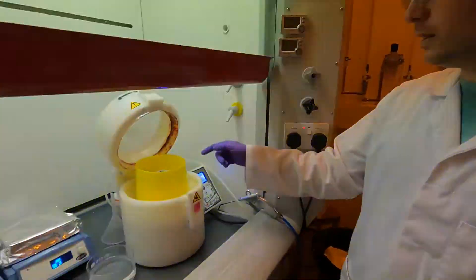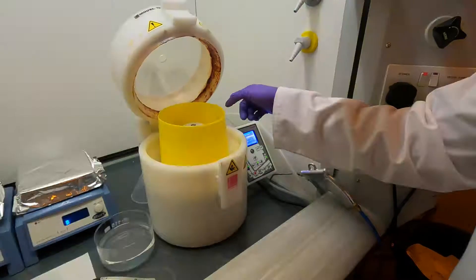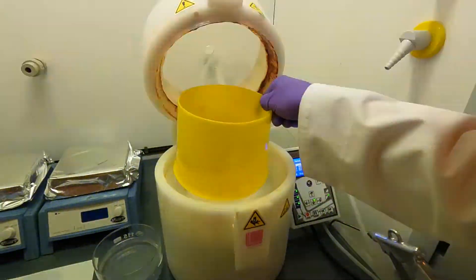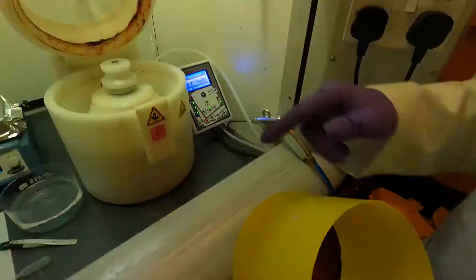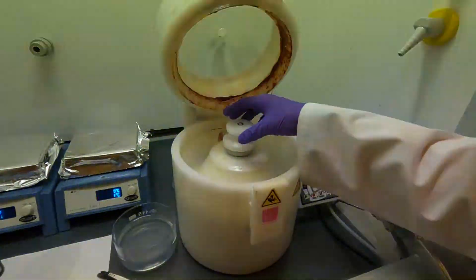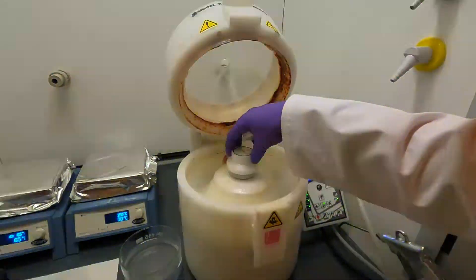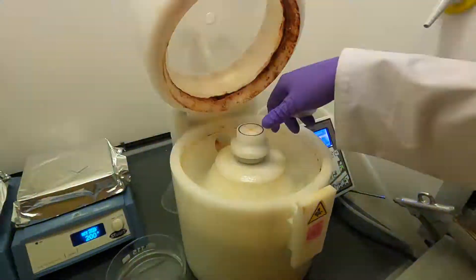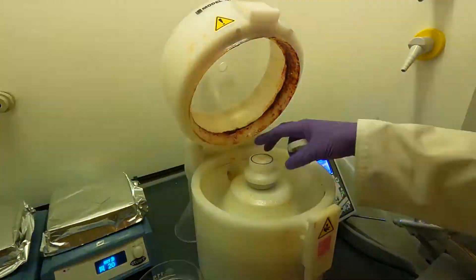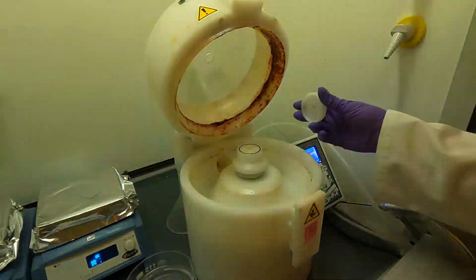This is the spin coater, it's quite a simple instrument. We've got essentially this splash guard for the liquid, and all it is essentially a chuck which spins. There's a motor underneath which will spin this chuck at the speed that we want.